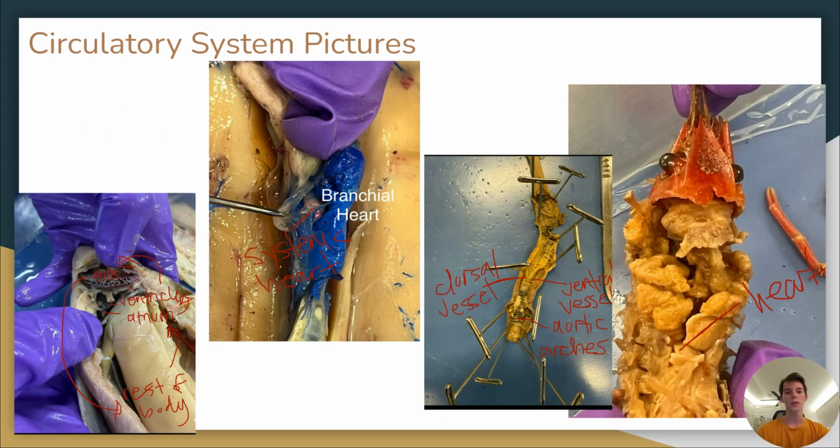And then the circulatory system, as you can see, they're all going to have a heart to pump blood, and they all have vessels for circulation. And all of their systems transport oxygen and nutrients and expel waste products. The differences are how they're specialized.